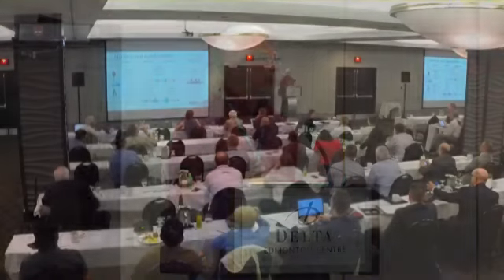And so what we do is we build our models, and we start to analyze that data. The device also gives us information that says, the stuff that I'm seeing right now isn't in my existing model. So we can use that information to tell an end user, this is a really good time to get a grab sample, or to call us and have us come out and take some grab samples and start to paint the corners, if you like, of the picture, so we get a bigger and wider model space. But you're right, it comes down to, is the fluid that I'm looking at right now within the range of things that we've taught the analyzer to look at?